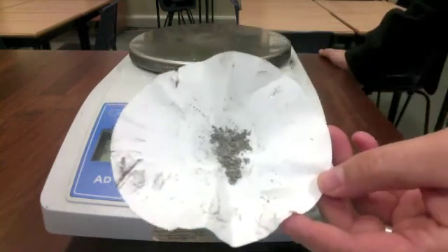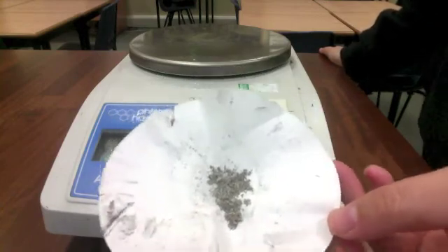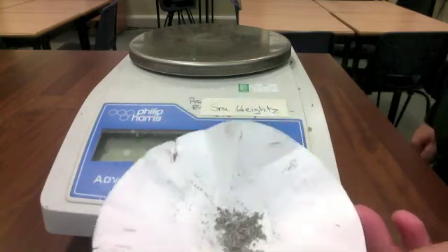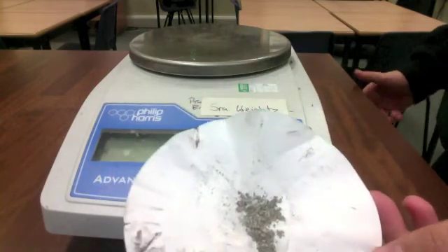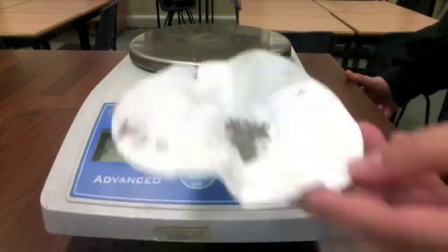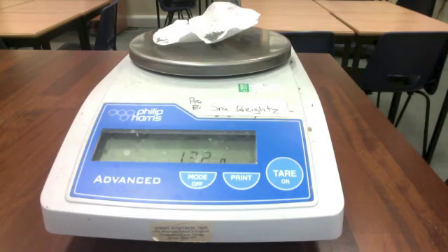All right, here we have the precipitate that did not go through the filter paper. Before I started the filtration, I took the mass of the filter paper on its own, and it was 1.09 grams. Now that I've allowed my precipitate and the filter paper to dry, I'm going to take the mass again, and it comes out to 1.32 grams. Knowing this mass, it will allow me to use stoichiometry and go back and determine what was the original concentration of that unknown silver nitrate solution.